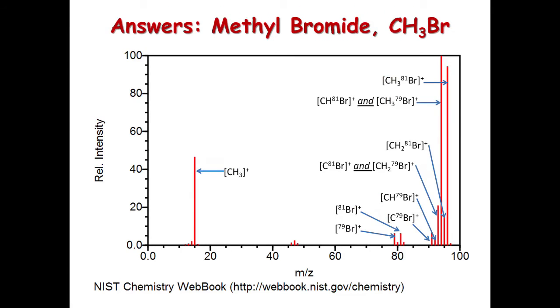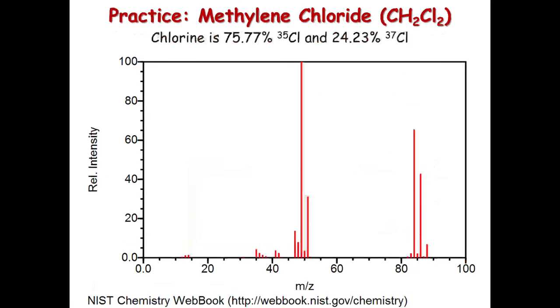And so you can analyze what all of these things were based off of masses. And that's what somebody who really would read these for a living does, is that they look at all the possible peaks.